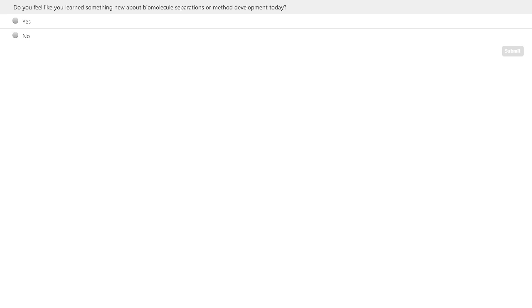Okay, terrific. Next question. How do we know which ion pair reagent is suitable for my compound? Oh, that is the $1 million question, and I think I would do very well if I knew the answer to that. Trial and error, I'm afraid, a lot of the time. If you've got a screening system, you tend to not want to put ion pairs on there because they do modify your column.